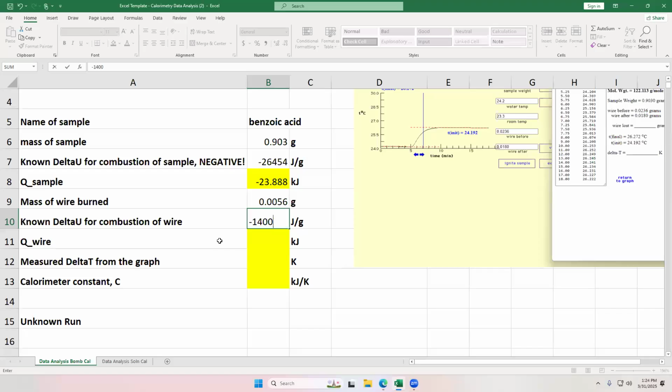It's another unit. I forgot. One thermochemical calorie is 4.184 joules. So I have to multiply this by 4.184 to get the value in joules per gram. Okay.